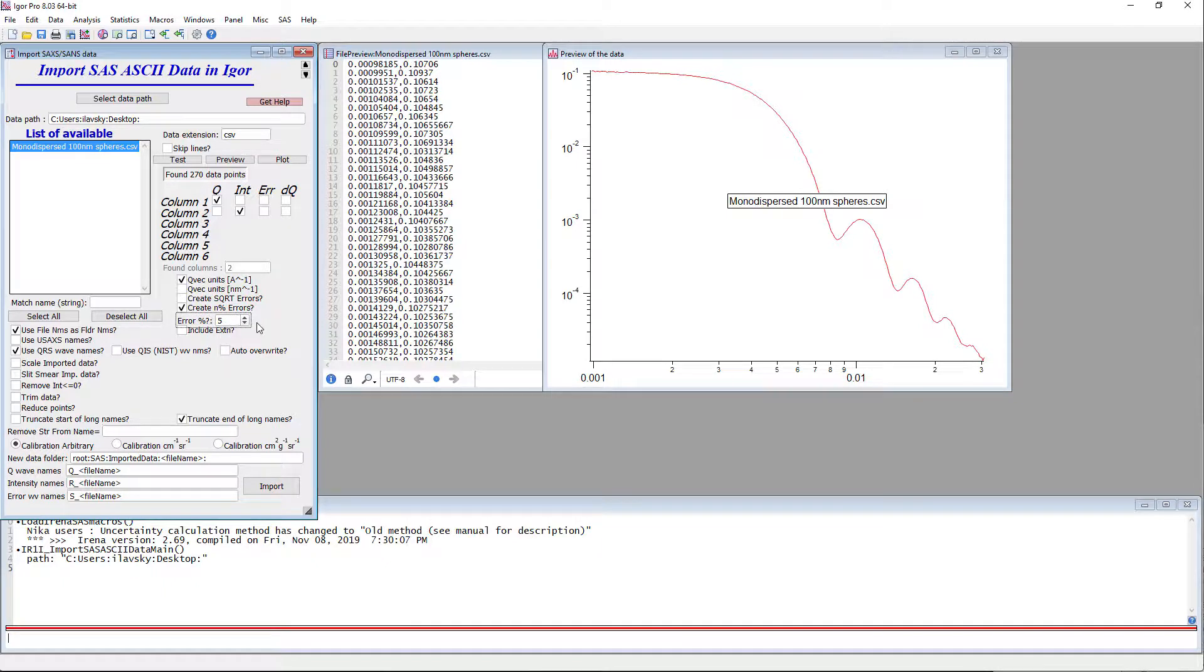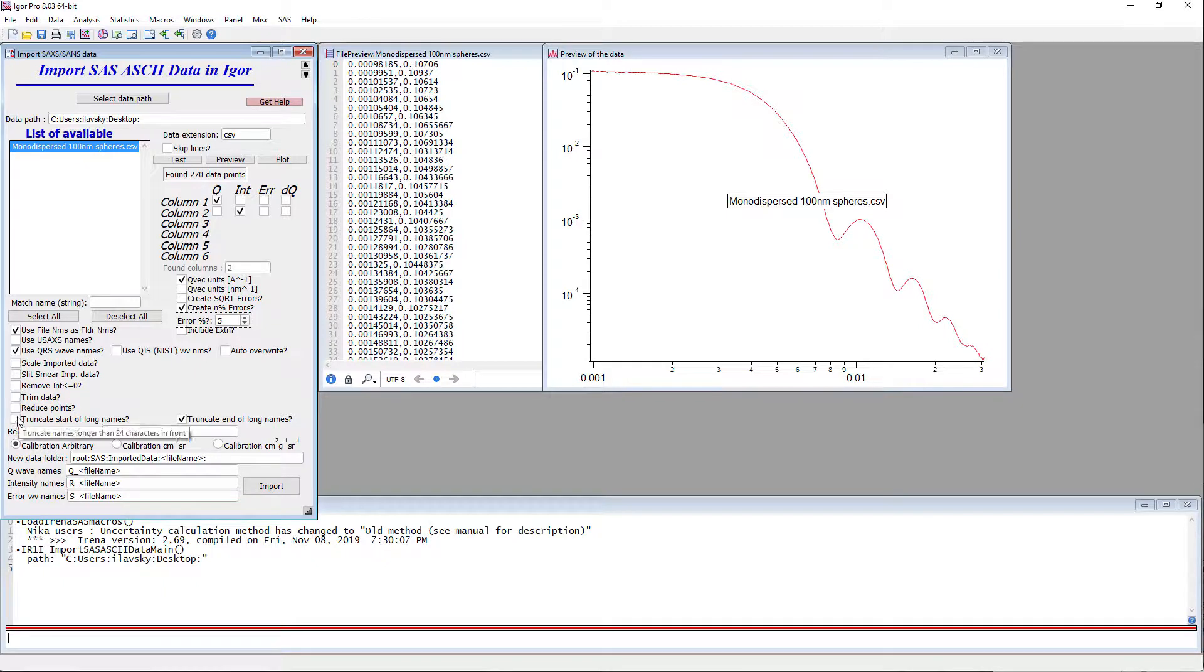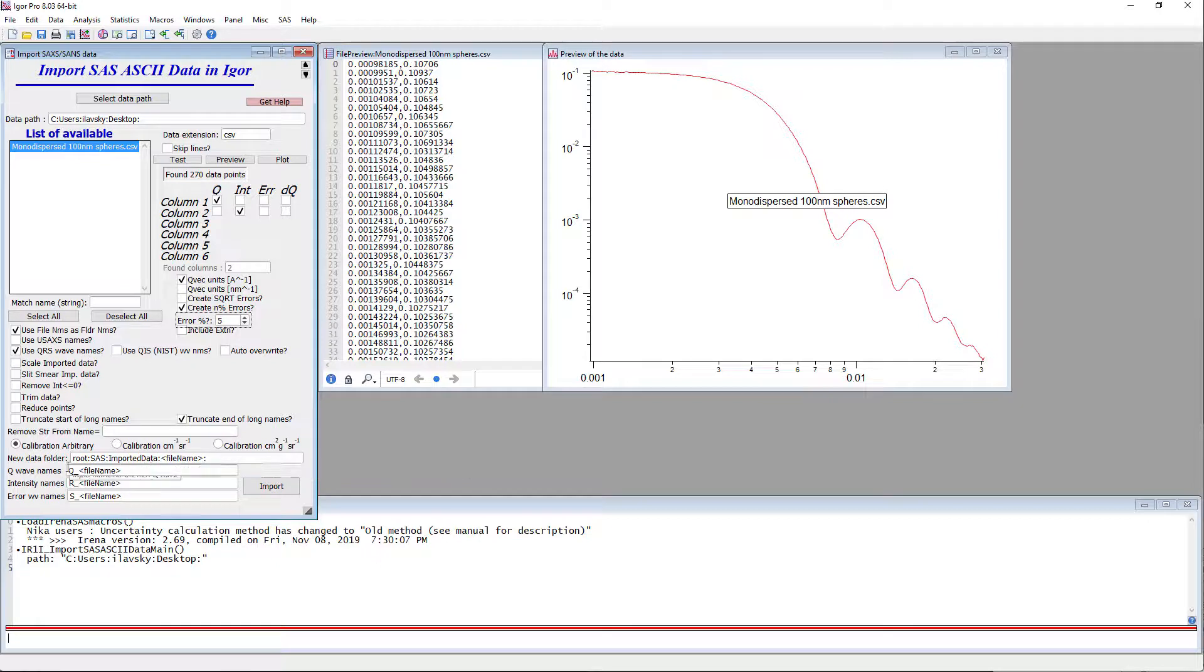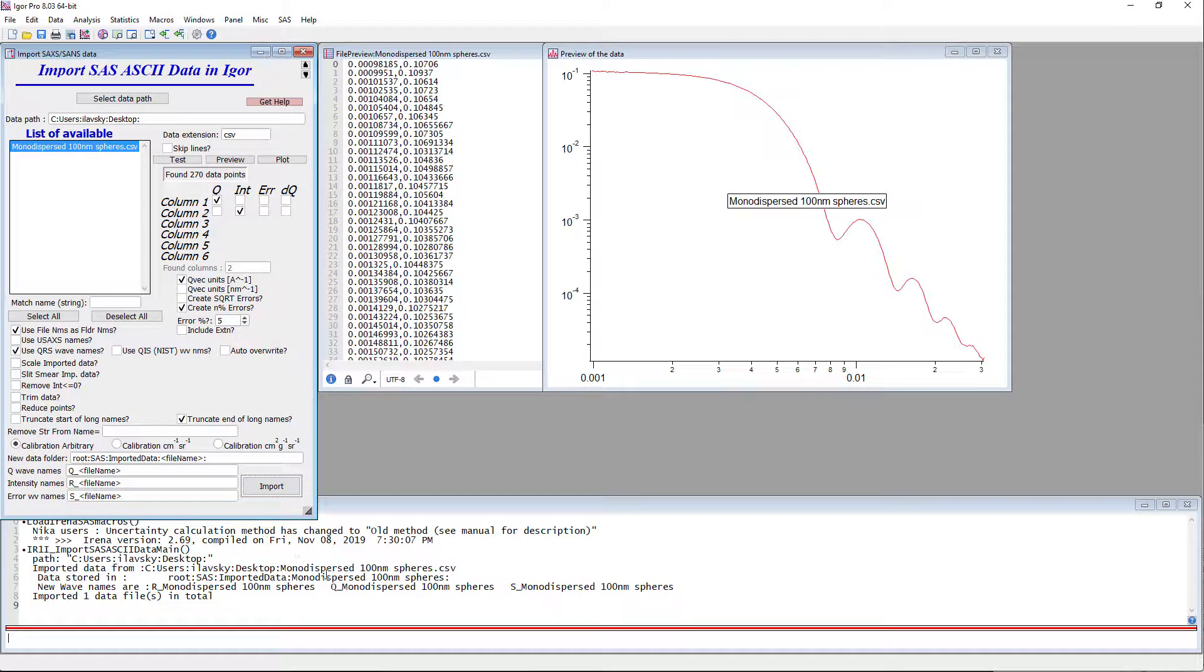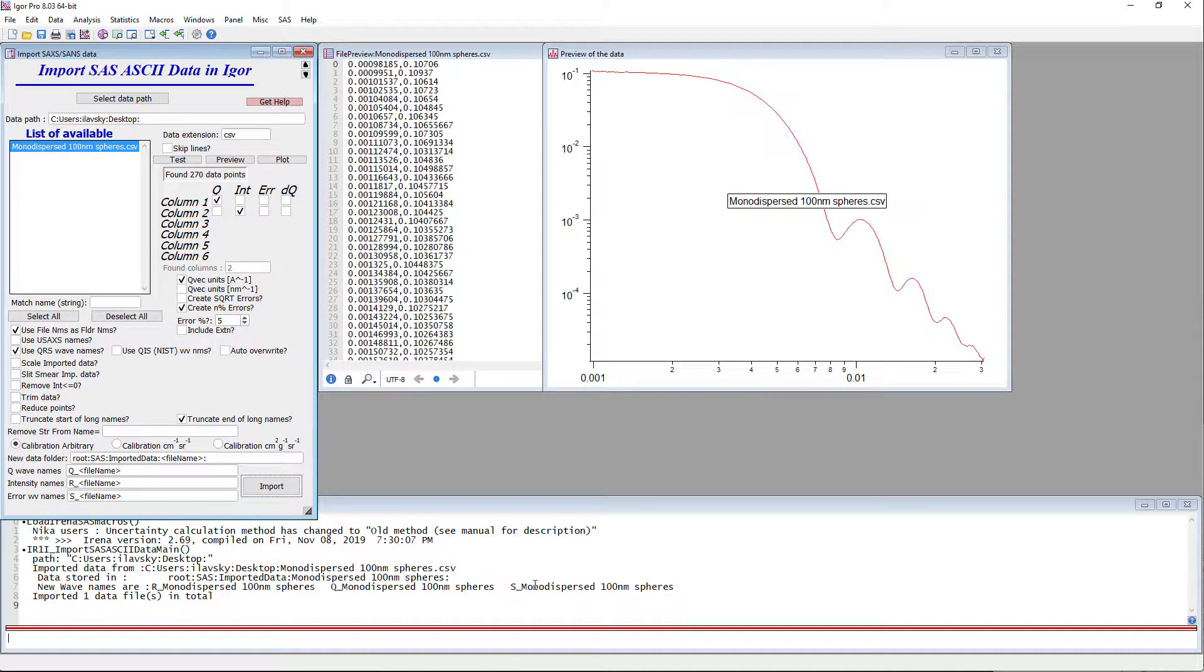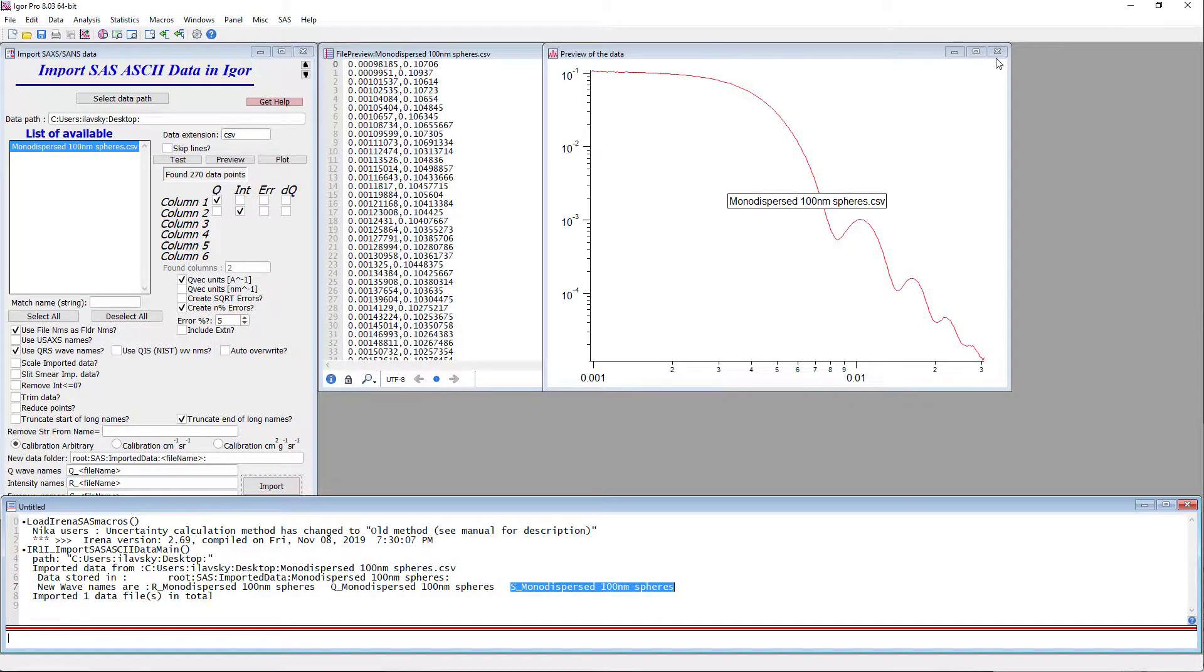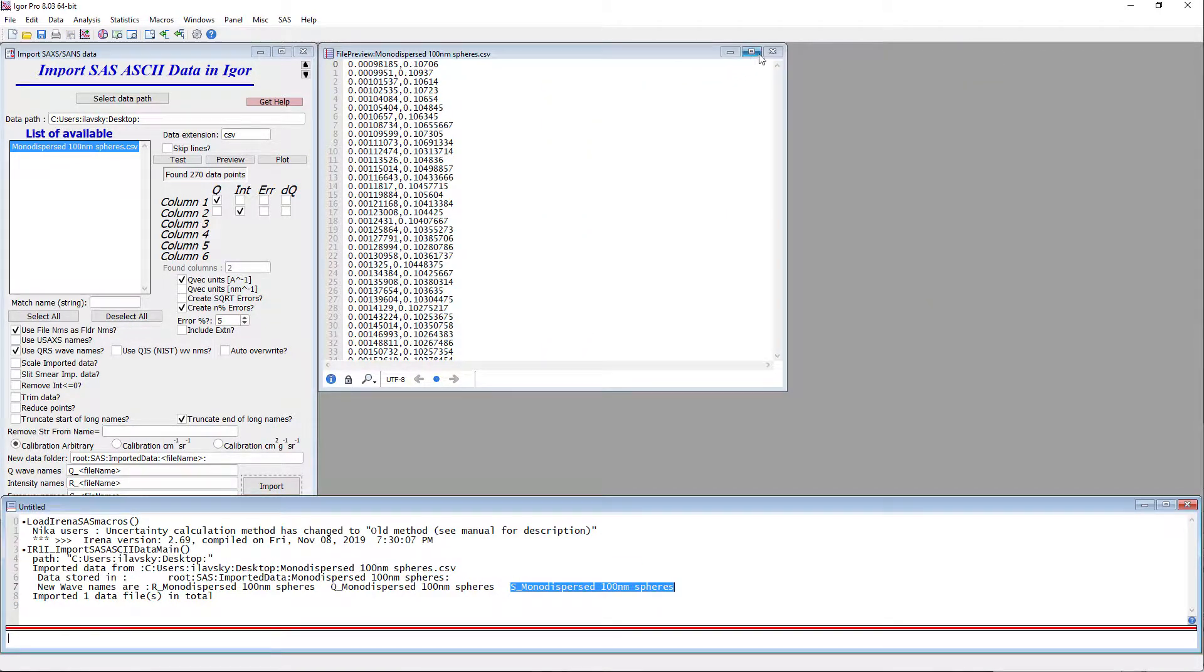IRENA does need uncertainties for intensities, always called sometimes errors. So we're just going to create errors and just make 5% errors. That actually works surprisingly well for fitting in IRENA. Just assign a fractional error of a few percent to each data point. And under most circumstances, IRENA is going to be happy. Let's truncate the end of long names. This is perfectly fine. And just do import. What you see is imported monodisperse 100 nanometer spheres. And it created Q, intensity, and uncertainty.